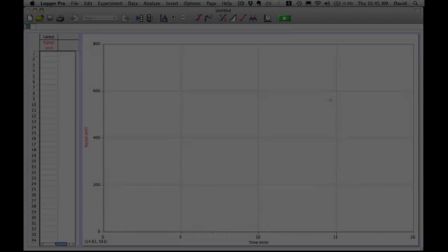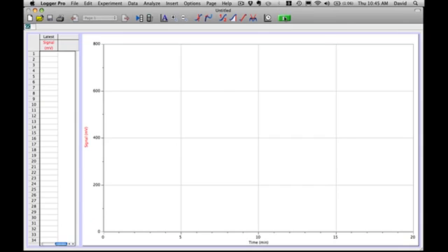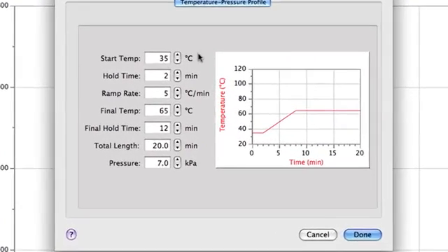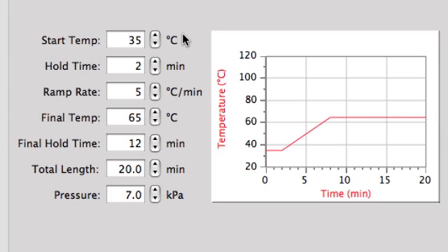We're going to demonstrate this on a computer, but everything that we're going to do here can also be done on the LabQuest. I've launched our Logger Pro software on the computer and to start things off, I'm just going to click on the collect button. When you click collect in Logger Pro, it doesn't start the data collection like our other sensors. It sets up a data collection profile for the Mini-GC that has several parts to the profile.